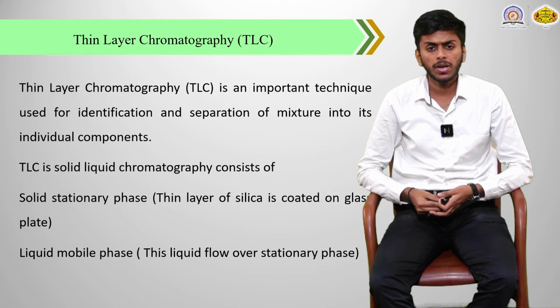Next is thin layer chromatography. It is an important technique. It is solid-liquid chromatography, consisting of a solid stationary phase, which is an alumina or silica coated plate of glass, and the liquid phase may be any solvent system.